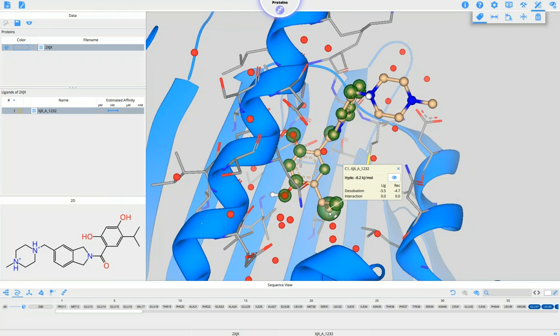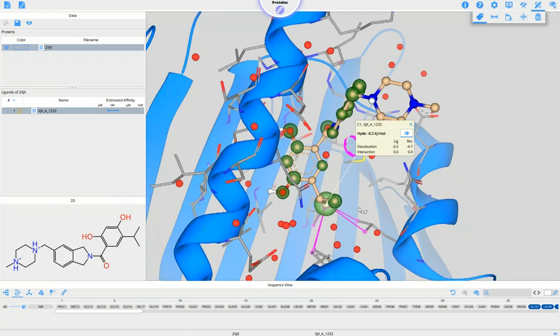For the ligand, this makes of course sense. I can see that with my eye that I have a methyl group deeply buried inside the binding site. This is of course a favorable mode of binding, but for the receptor I don't quite see it right now. So I can click on that eye here. I can, by the way, remove that label and pull it to the side by just holding it.